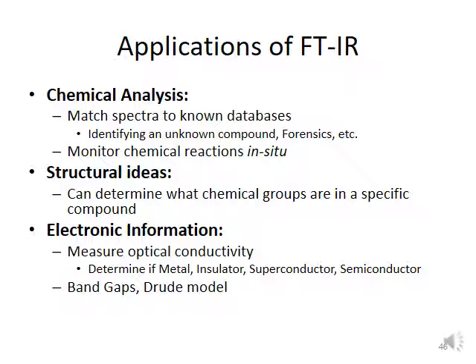Okay, next is structural identification. We can also determine the chemical group or functional group that is specific in the compounds, either a carboxylic acid, an alcohol, or an amine group. So we can simply determine a variety of functional groups in our sample by using FTIR.